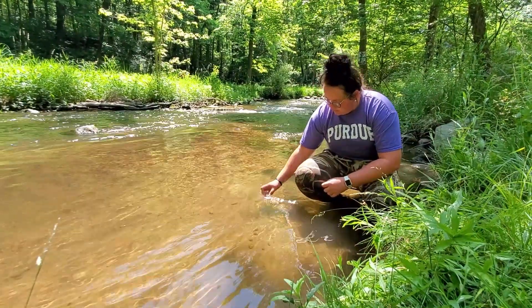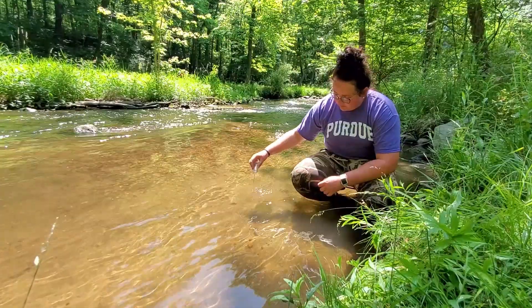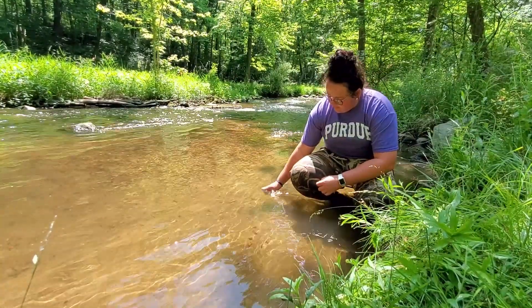First, triple rinse the sample cup in the same water you will be testing. Then fill the sample cup with the water to be tested.